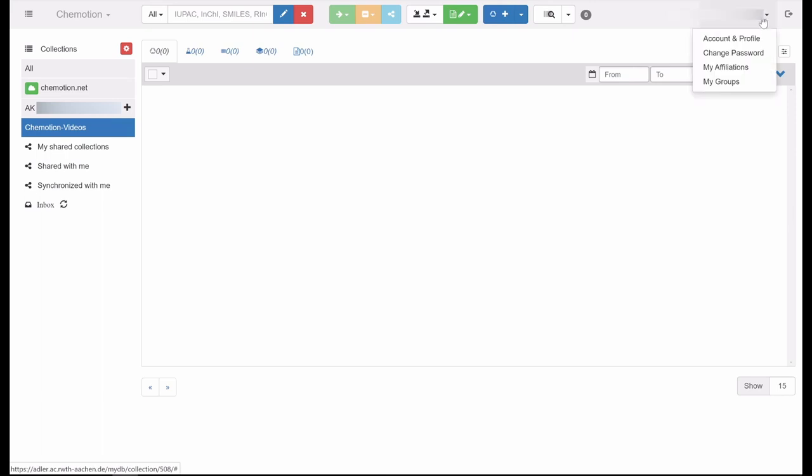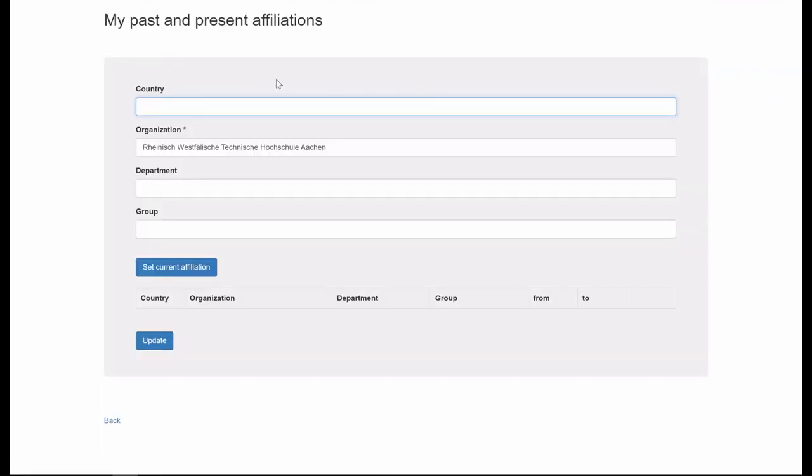Under my affiliations, you may enter your affiliations to universities or other organizations. In this context, you can specify information such as country, organization, department, and working group.